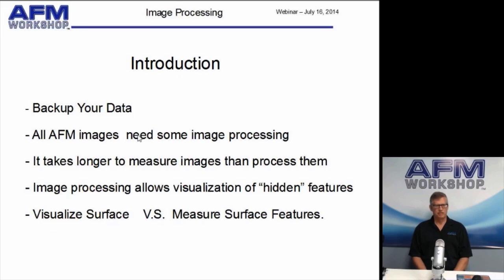Okay, so the first thing is make sure to back up your data. It costs a lot to buy one of these instruments, and it costs quite a bit to measure the images. So as soon as you get images, back them up on a memory stick or on a hard drive. Make sure you don't lose your data.